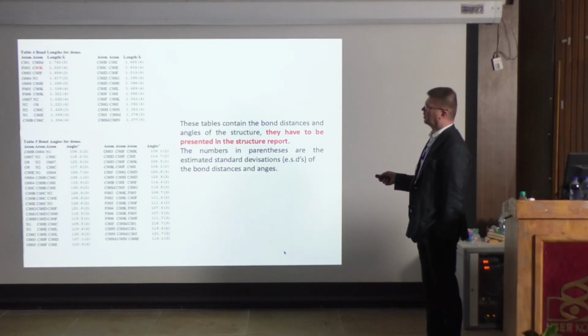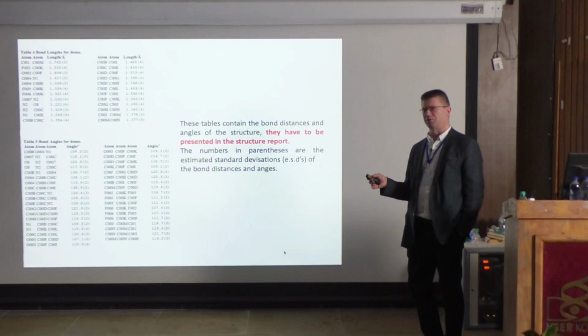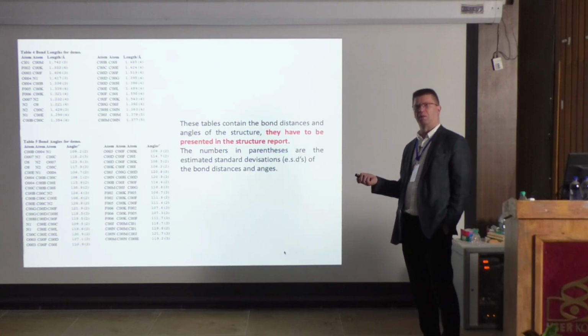But that's the idea. In here you can see then the fluorine carbon distance is about 1.35 roughly. And then there is O carbon, this is 1.4, this is an OH distance. And then we have here, again, one of the same fluorine carbon, 1.331. And you can see, even though it's the same bond, carbon-fluorine bond, it's never exactly the same.